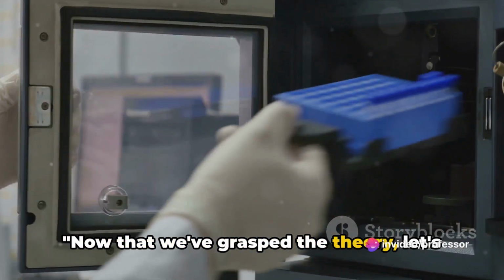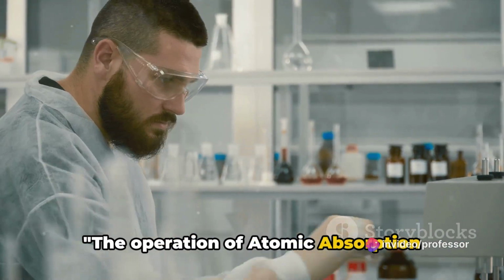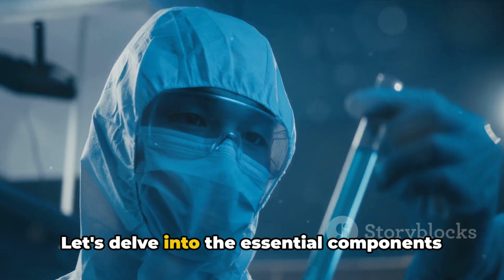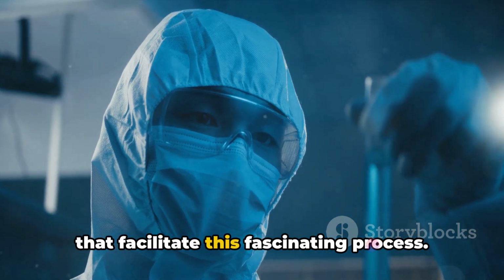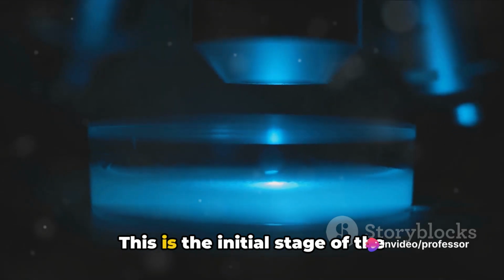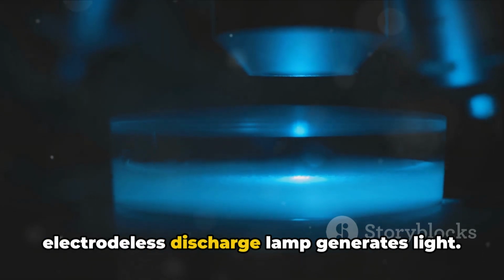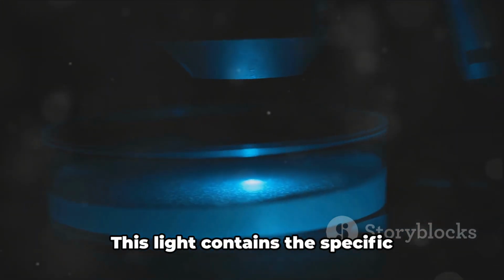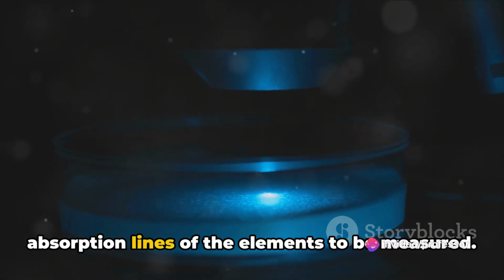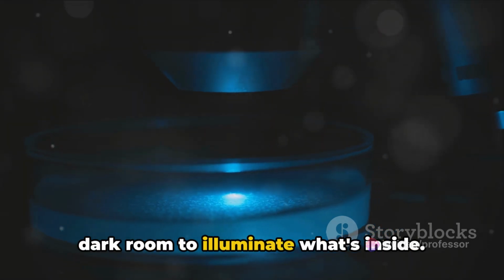Now that we've grasped the theory, let's explore the instruments that make this process possible. The operation of atomic absorption spectroscopy relies on a set of specific instruments. Let's delve into the essential components that facilitate this fascinating process. First up, we have the light source. This is the initial stage of the procedure, where a hollow cathode lamp or electrodeless discharge lamp generates light. This light contains the specific wavelengths that correspond to the atomic absorption lines of the elements to be measured. It's like shining a flashlight into a dark room to illuminate what's inside.